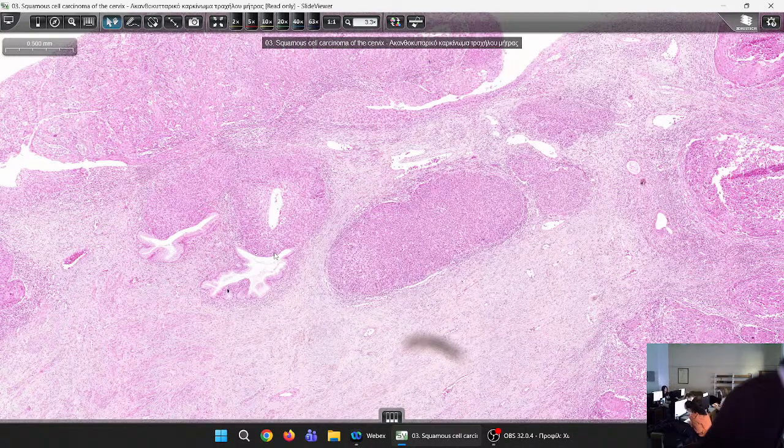However, if dysplasia enters this part of the glands, because you have the glandular epithelium in the lamina propria, and on the surface you have squamous epithelium. How is this called? This is metaplasia, squamous metaplasia.